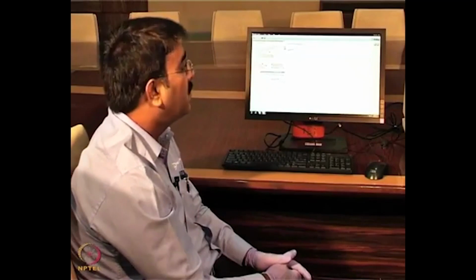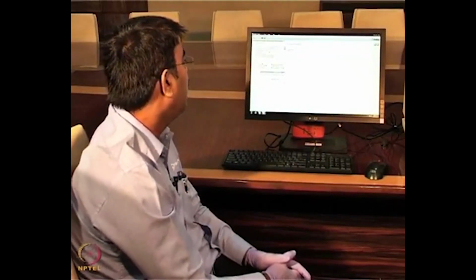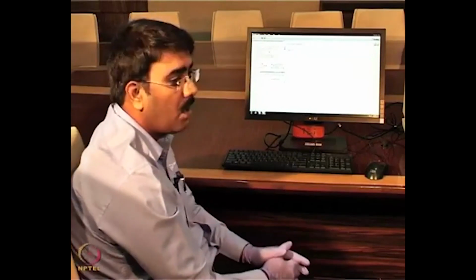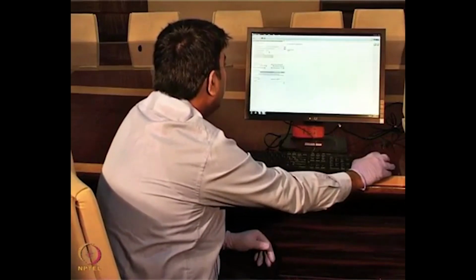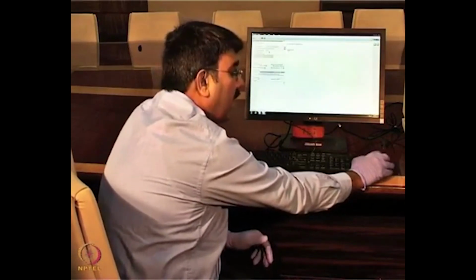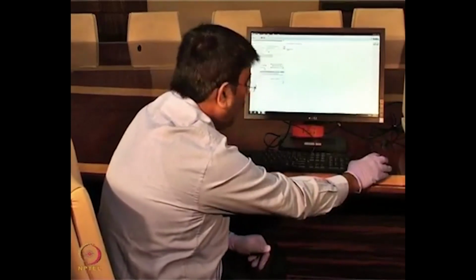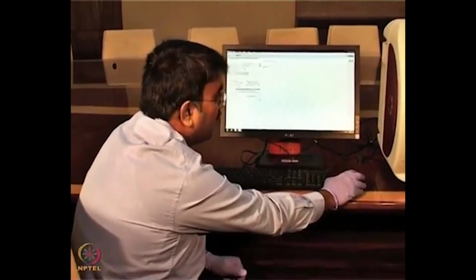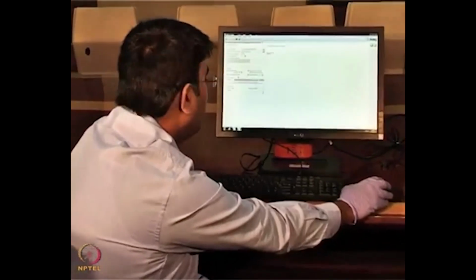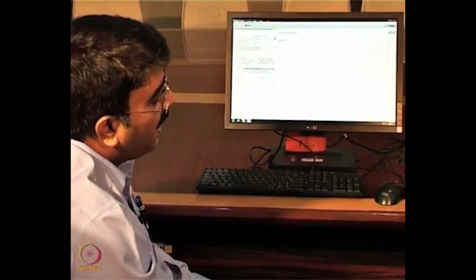Okay. Whenever you are performing the experiment, sensors have to be hydrated prior to the experiment. At least 10 minutes is required for hydration. Suppose your sensors are not hydrated, we can set a delay of 600 seconds in the software. 600 seconds is nothing but 10 minutes. After the hydration, the instrument starts acquisition. The second option is whether your sample has to be under shaking conditions during the hydration, because the instrument has a shaker, which will effectively mix.